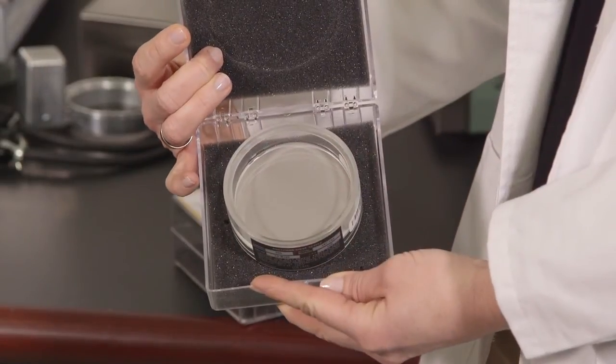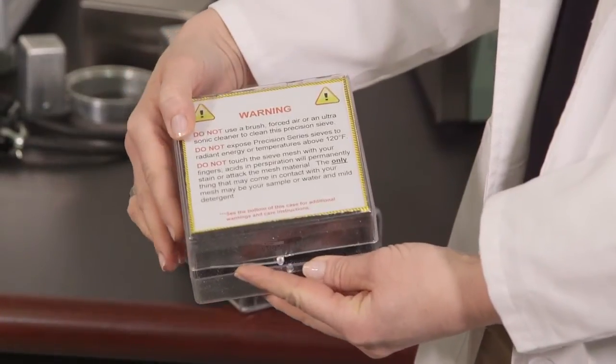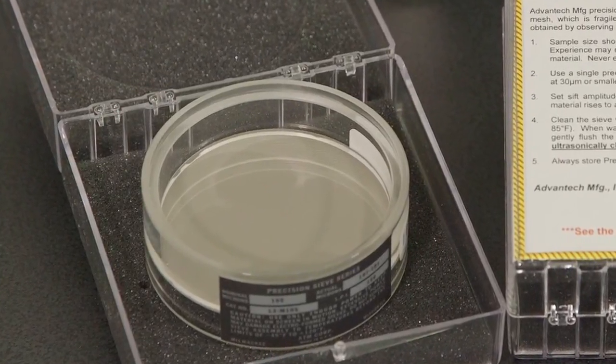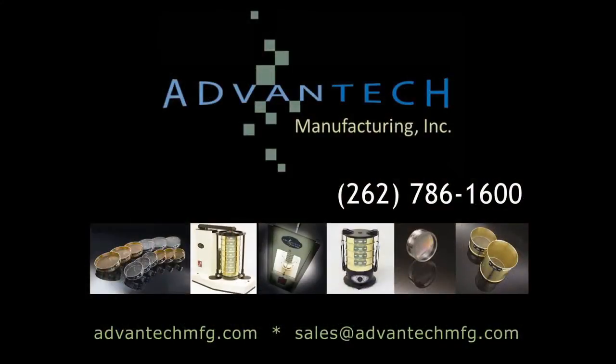Always store your precision test sieve in the original protective box in a clean, dry environment. Test sieves treated with the correct use, handling, and care will reward you with a long service life. For additional Advantech Manufacturing product and instructional videos, please visit our website at AdvantechMFG.com.